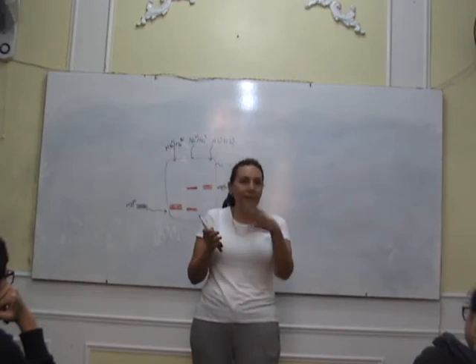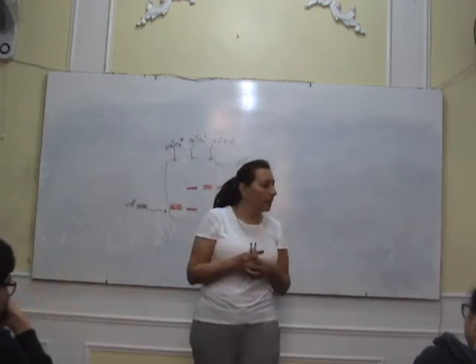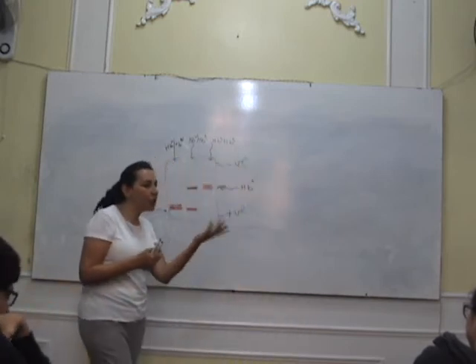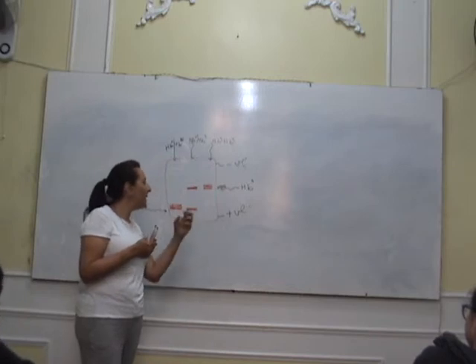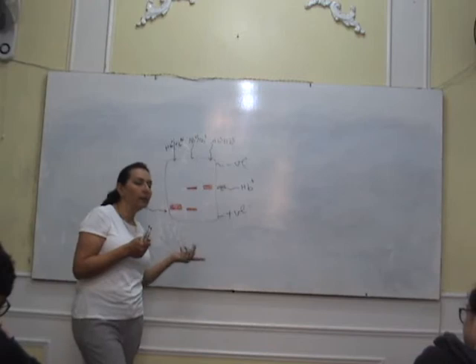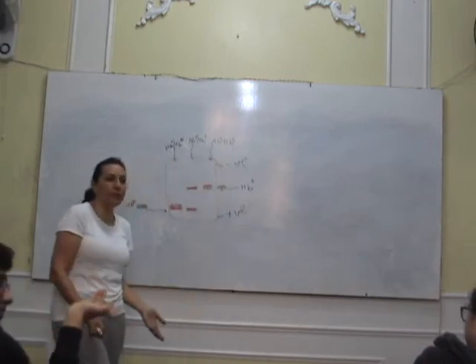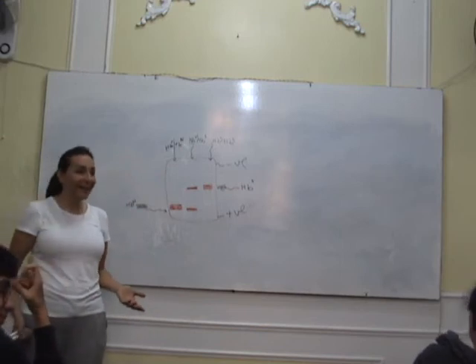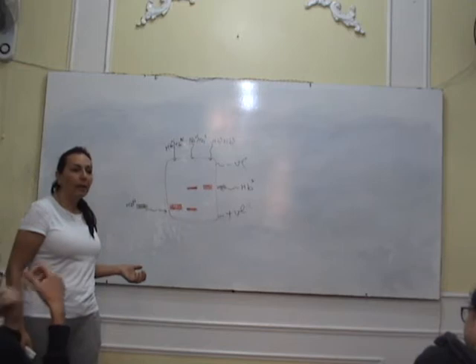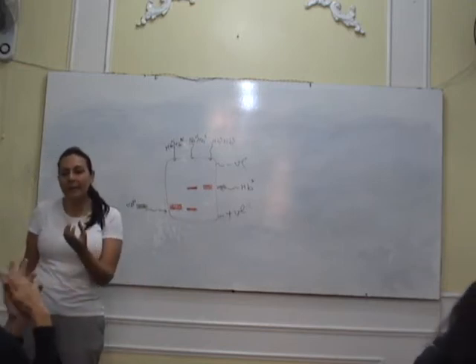على اساس التشارجز اللي فيه، على اساس ان السيكل هيموجلوبين فيه less charges than the normal hemoglobin. بس العمال ده هيموجلوبين ولا بروتين؟ هيموجلوبين بس بروتين طبعا. الاتش بي ان والاتش بي اس، الاثنين هيموجلوبين. يعني لا انا بقول هيموجلوبين من جوه الريد بلاد سيل بتاعي.